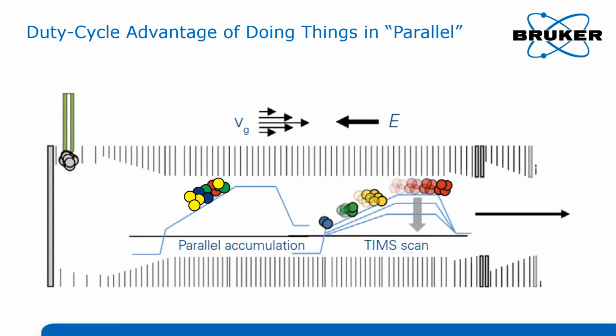So that was the basic principle of TIMS separation. However, the actual instruments have one additional section in the TIMS cell to achieve much higher efficiency. As you see on this diagram, there are two sections with electric field gradients. While separation and elution take place in the second section on the right, all incoming ions are accumulated and enriched in the middle section. Once separation and elution of the previous cycle is complete, all accumulated ions are transferred from the middle section to the analyzer on the right, and the process repeats itself.